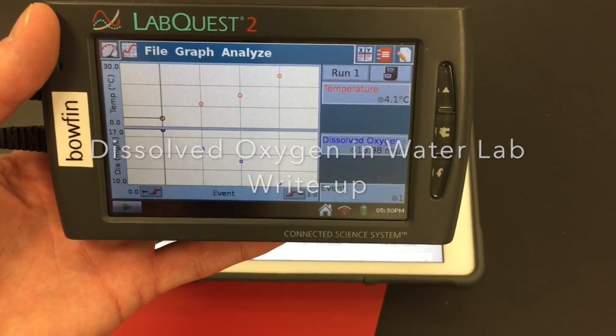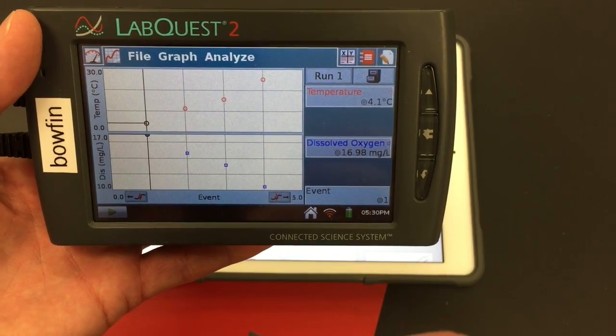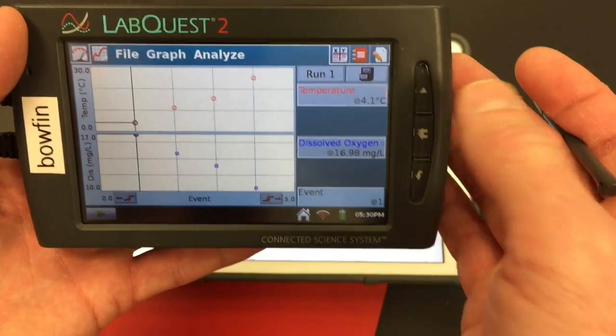Now that you've collected the data, you're going to want to connect your iPad to the LabQuest device.